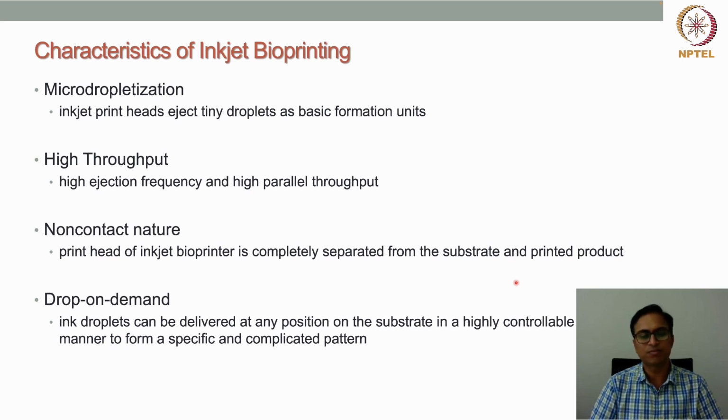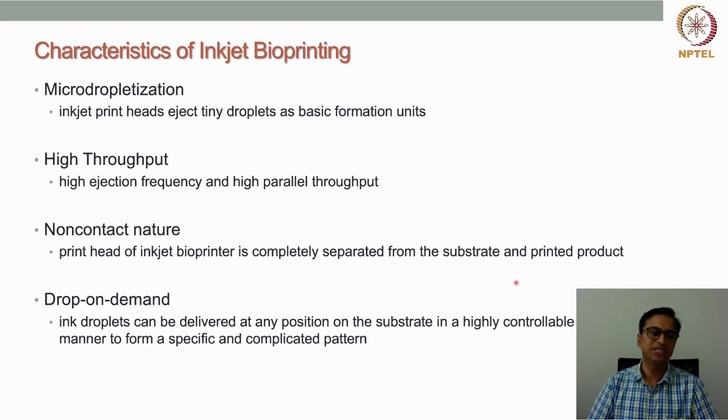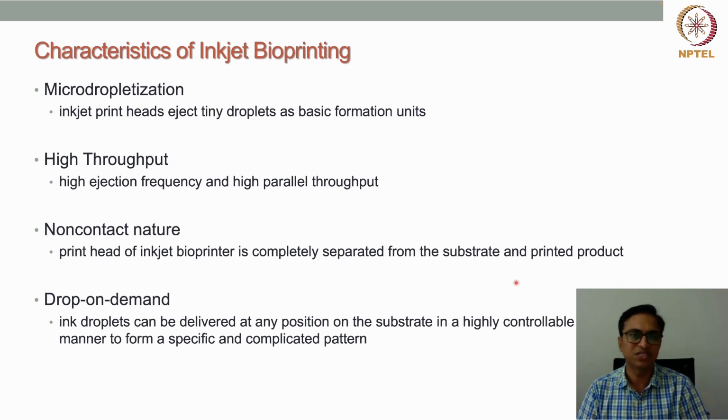The other thing is drop on demand. As we have seen, whenever a droplet is required, only at that time are the drops generated. So drop on demand is a very important characteristic of this bioprinting technology.